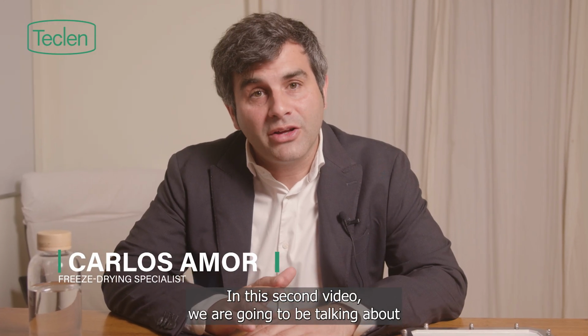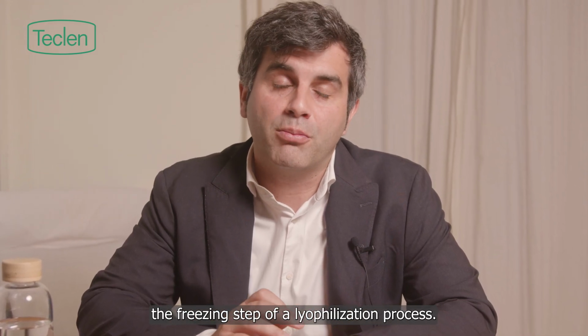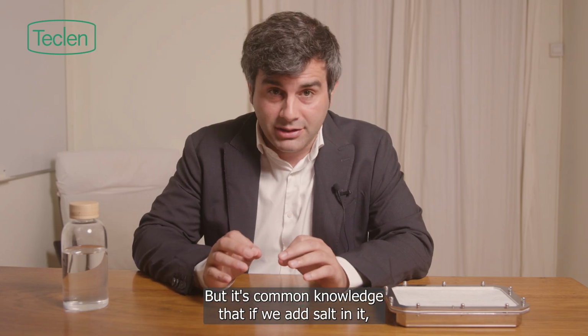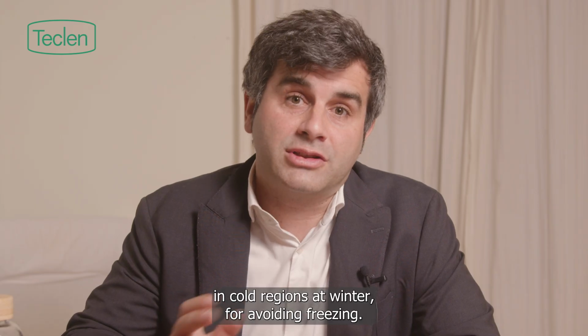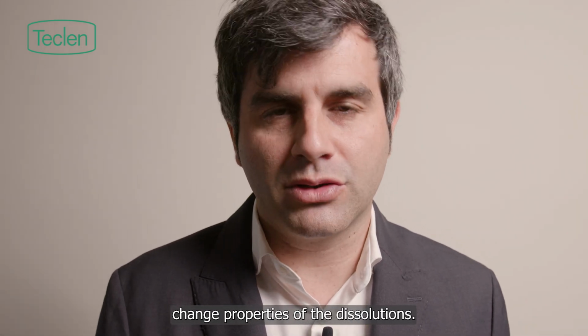In this second video, we are going to be talking about the freezing step of a lyophilization process. Water freezes at 0 degrees, but it's common knowledge that if we add salt in it, the freezing point decreases. This is the reason why we are using salts on roads in cold regions in winter for avoiding freezing. So solutes are modifying the phase change properties of the dissolutions.